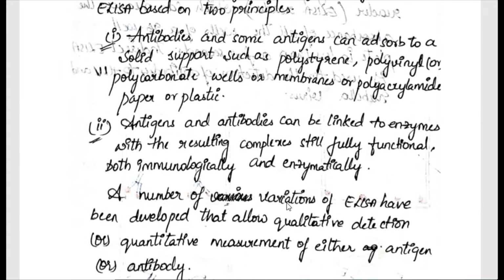Coming to the principles on which it works, there are mainly two. One is that antibodies and some antigens can adsorb, that means they can be imbibed or adsorbed, to a solid support such as polystyrene, polyvinyl or polycarbonate wells, or membranes or polyacrylamide paper.